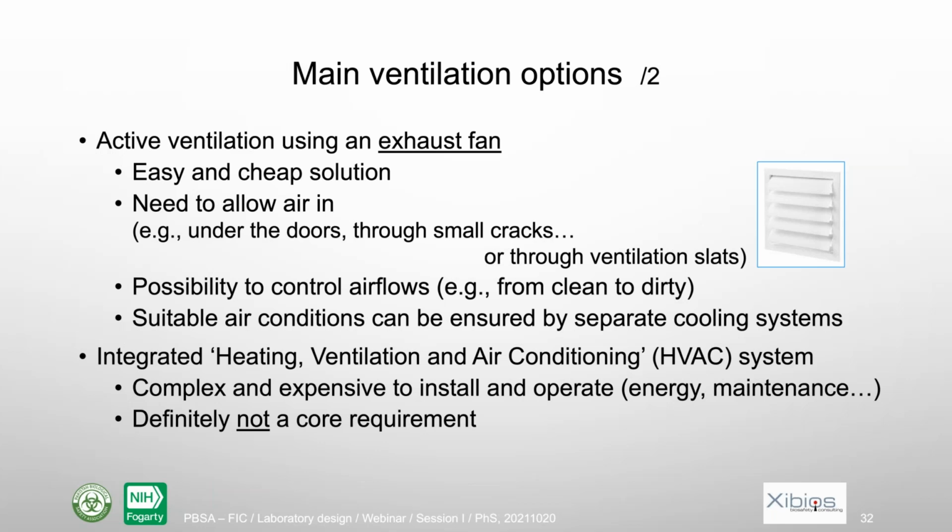If it's not the case, if there is not enough air that can come in, you could use some grills like on the picture, some ventilation slats to facilitate that. Also, if you use an exhaust fan, it's possible to control the airflow. That means to have the airflow moving from one part to the other, for instance, from clean to dirty. Still like that, if you ventilate, you may still need some separate cooling system.